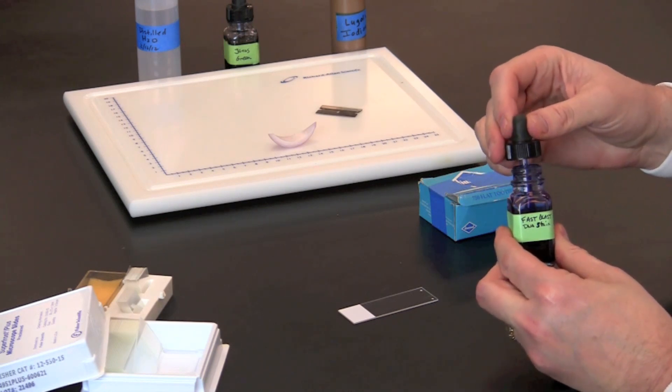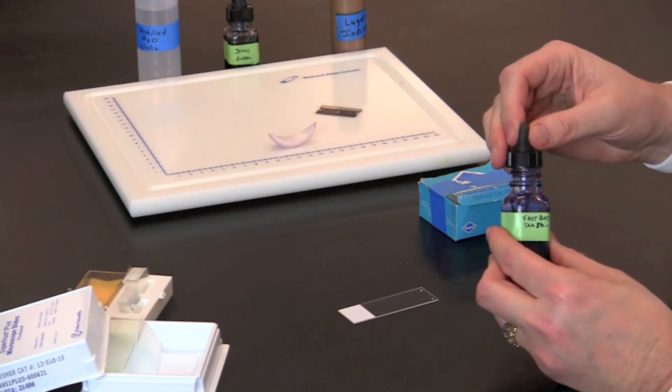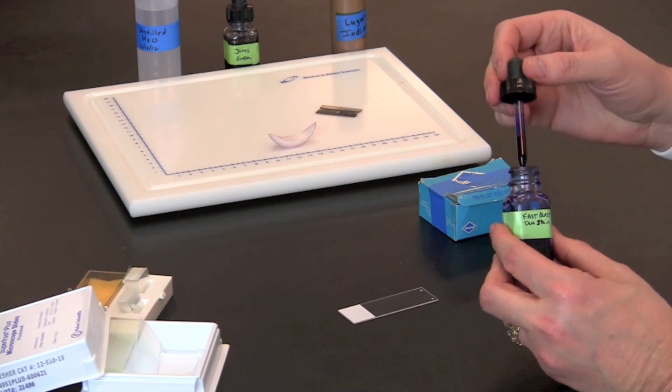To make a wet mount of cheek cells, place a drop of fast-blast DNA stain on a microscope slide.